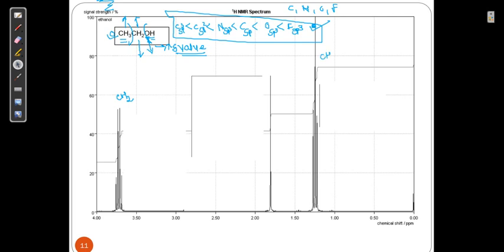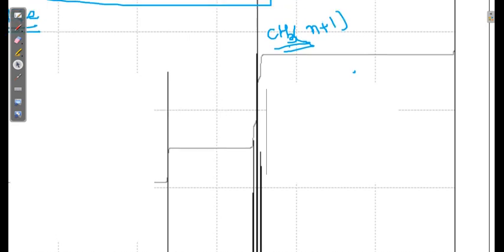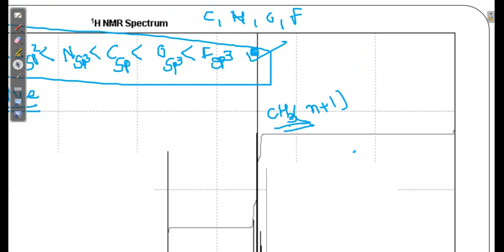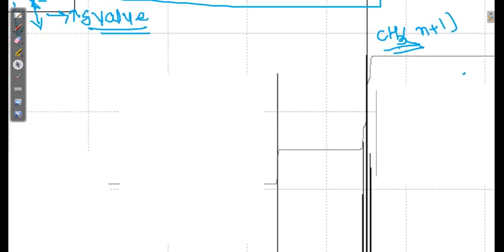CH2 has a higher delta value compared to CH3 because it is near the electronegative element oxygen. CH3 is split by CH2 using n+1, giving a triplet with pattern 1:2:1. CH2 is split by CH3, giving a quartet. The OH proton appears as a singlet because it is an exchangeable proton — it is continuously moving and has no coupling.